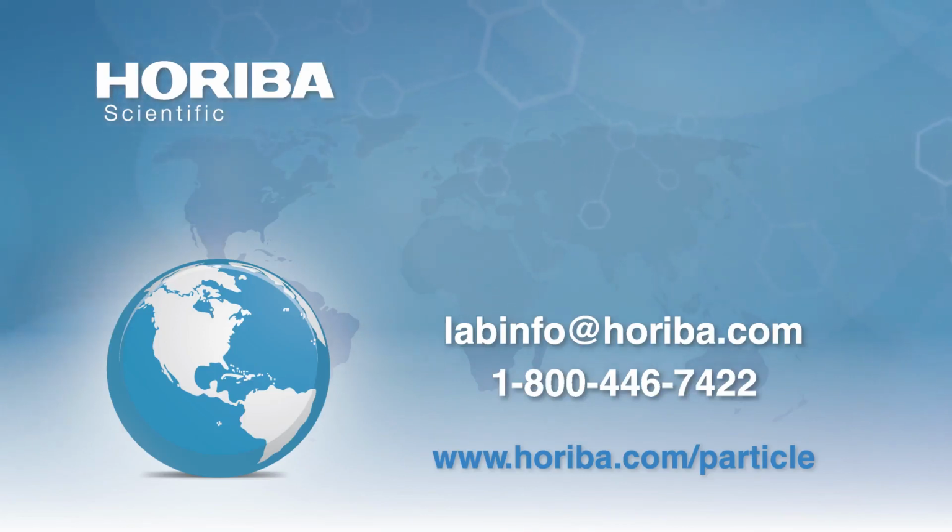And when you get to the point where the zeta potential goes to zero, you've also got to look at the size, because if the size stays constant, you now know absolutely that you're stabilizing the particles. I've got data showing how you can do this, where you take a particle and coat it with a hydrophilic polymer and completely stabilize the material.